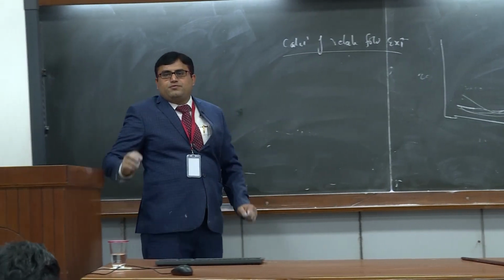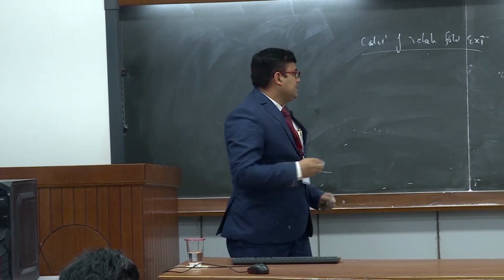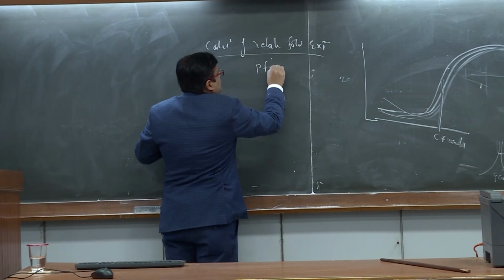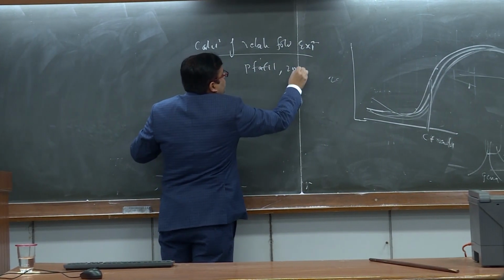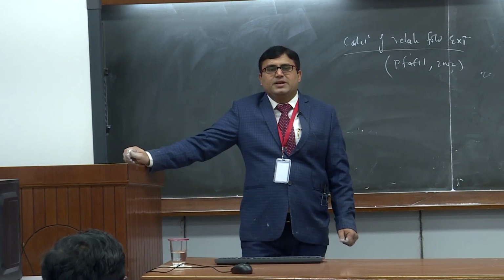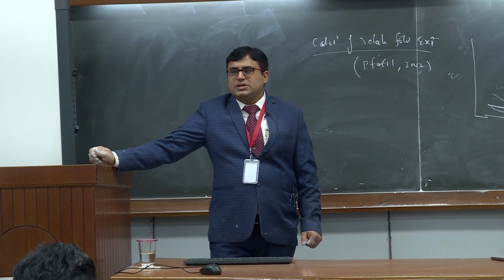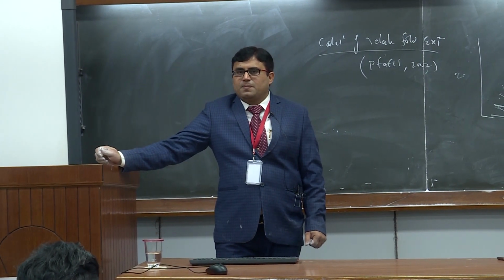Calculation of relative fold expression. The method we follow is called the Pfaffl method. Pfaffl, 2002, was the gentleman who first discovered the mathematical equation for the calculation of relative fold expression using the CT value. All right.